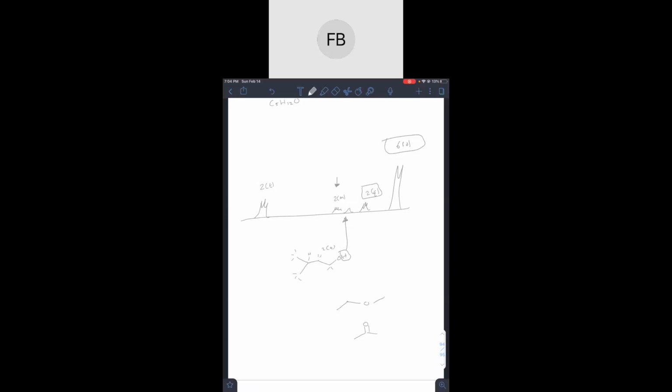Okay. So when he gives the multiplet, is he going to tell us how many there are? Sometimes it's not necessary because we finished all of this and we know that we have the right compound, so we don't really need to know how many were on that. And it would be really hard to count 7 little bumps. When I looked at all those bumps, I was like, oh my God, that's so much to count. I'm just going to call it a multiplet. Sometimes he will give you the number, but really it's not necessary most of the time. You have all the other numbers, so you can figure it out.